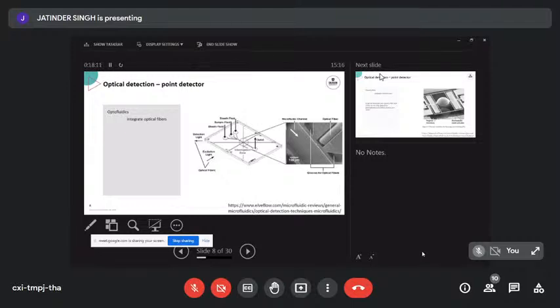And then there will be another one sitting here on the other side to collect the light coming through. So optical fibers can be integrated into microfluidic devices. If you know how big they are, you can make them part of the design. You can machine your channels for the optical fibers at the same time as you make your fluidics, and you end up with an optofluidic device.